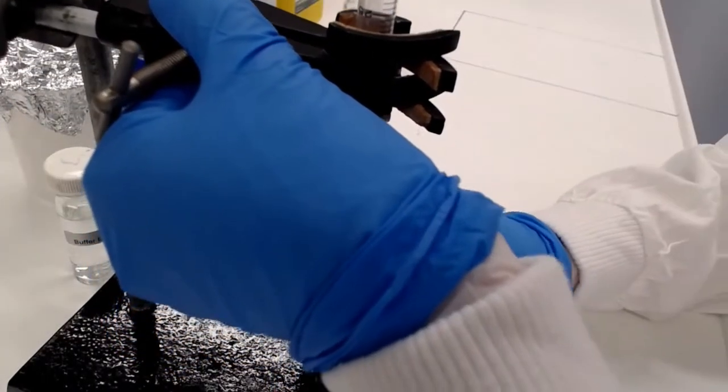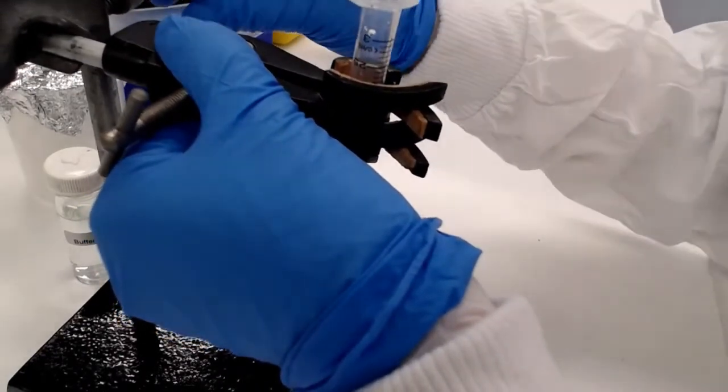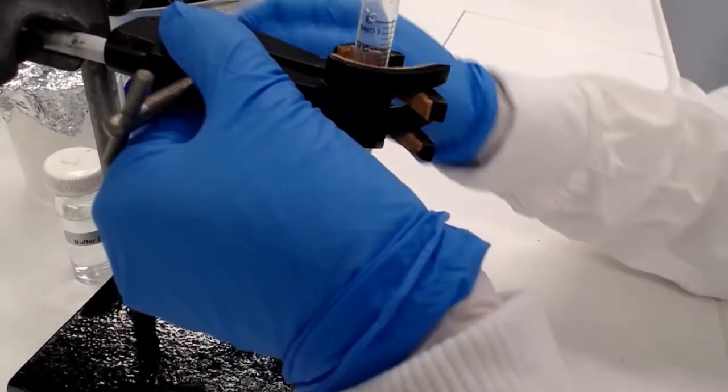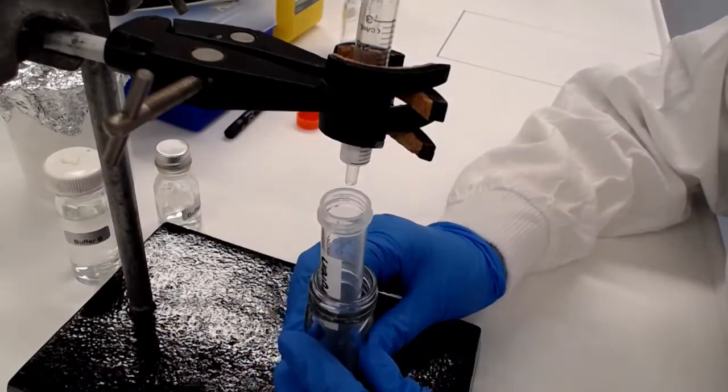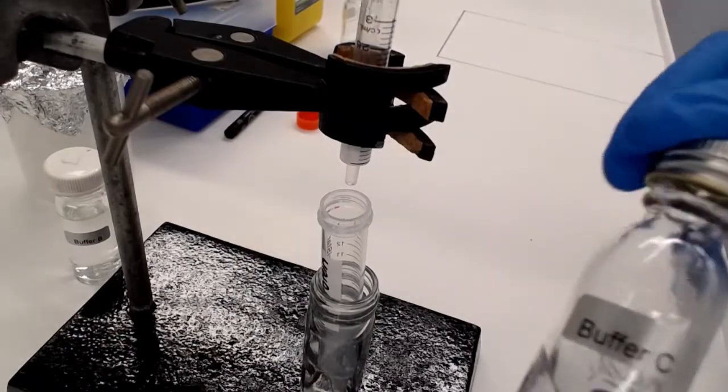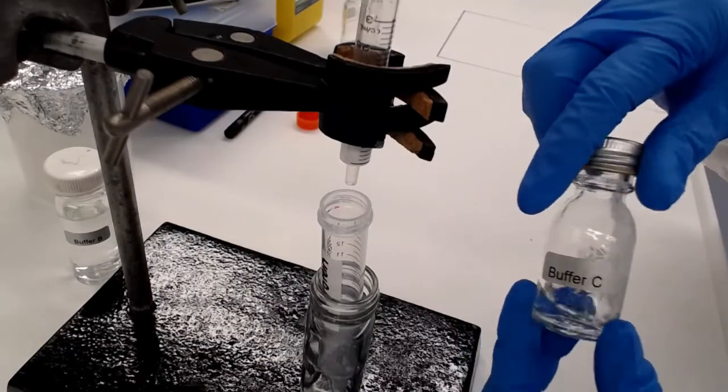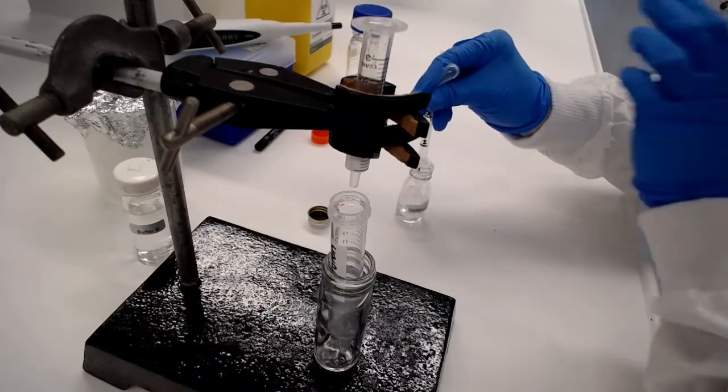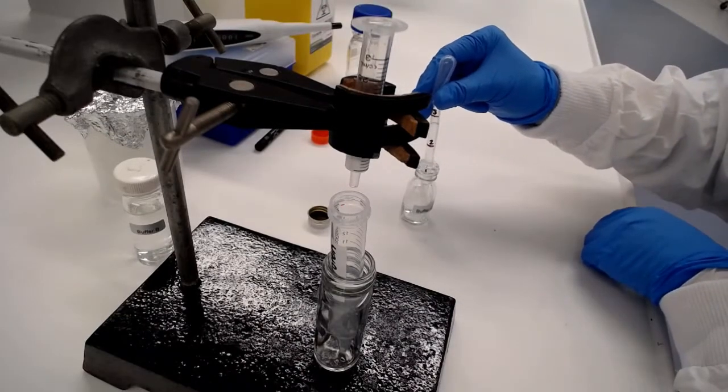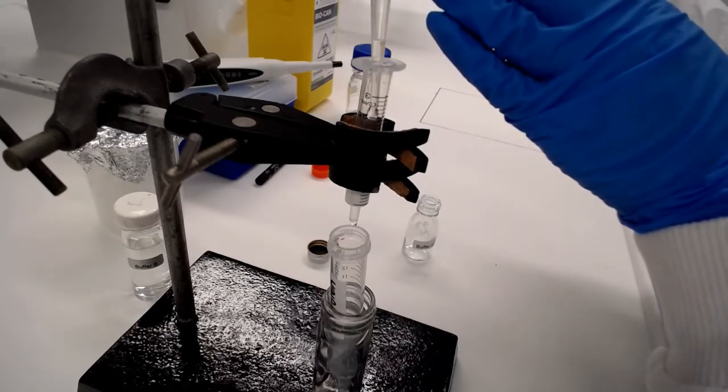Might need to adjust the height of the retort stand clamp here just so that the column sits down neatly inside the top of that falcon tube. Be careful that it's positioned correctly so that our painstakingly prepared PFU protein does not go onto the lab bench. We're using buffer C now. This is the high imidazole buffer and this high concentration of imidazole will now push off the his-tag protein off the column, eluting it into our catch tube.